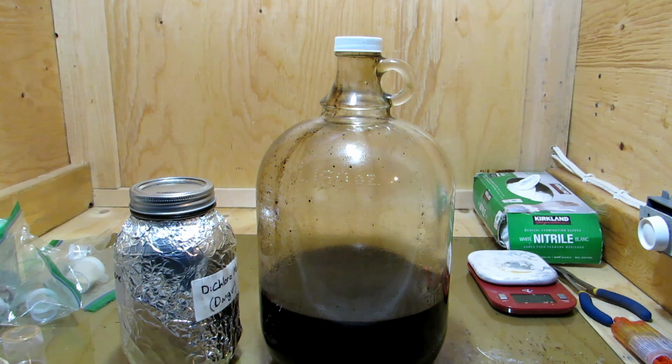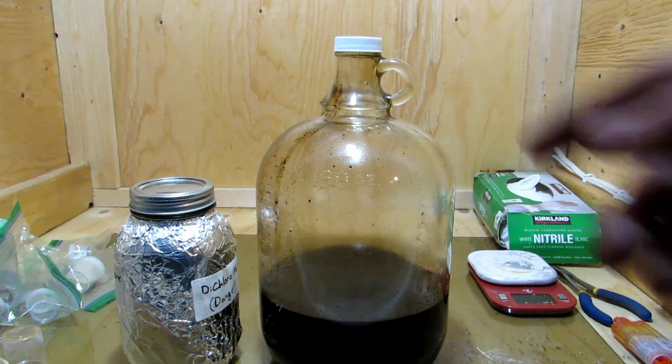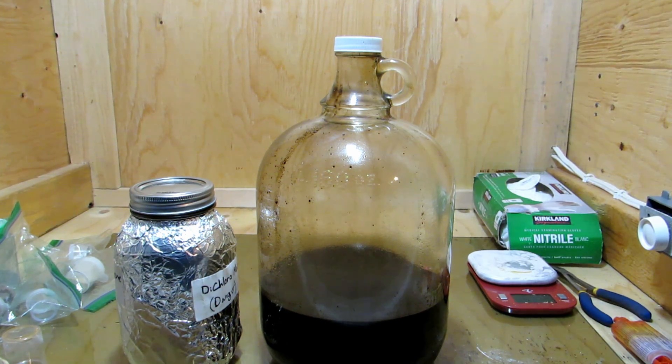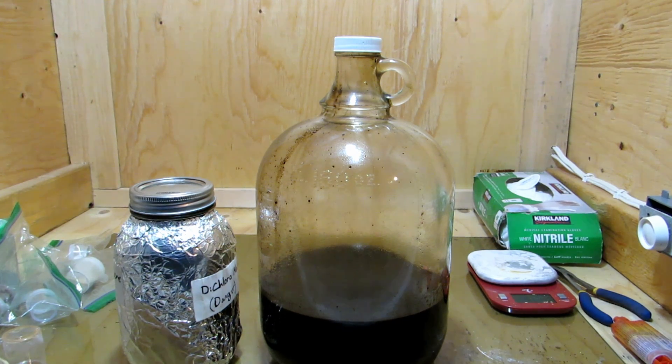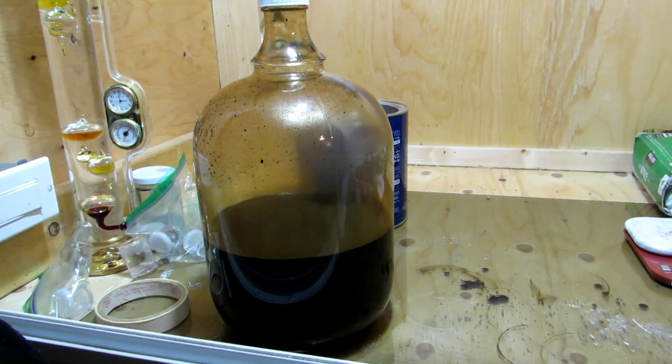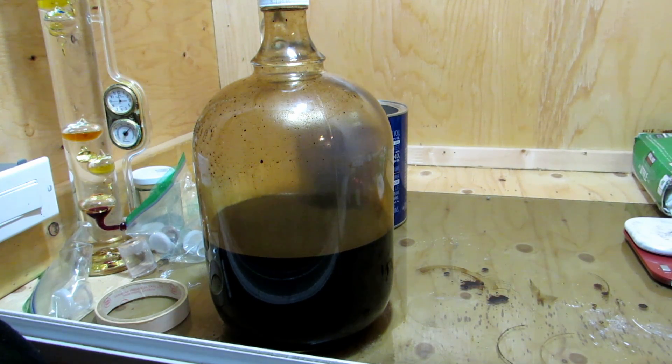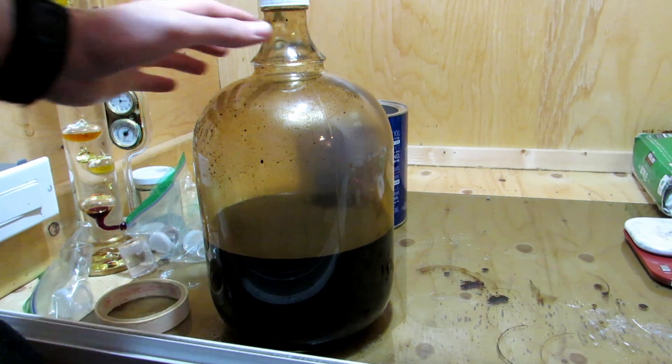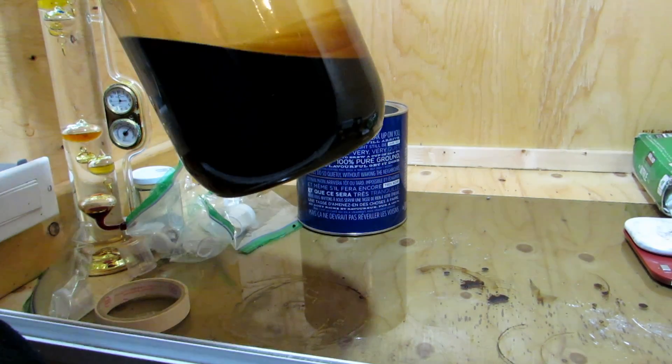We're going to add in all of our dichloromethane, and then we're going to be mixing this up fairly vigorously, but not too vigorously because we might form an emulsion. Hopefully all our caffeine will go into the dichloromethane layer. Our dichloromethane has been added, and I shook it around fairly vigorously. I shook it to get everything well mixed. Hopefully most of our caffeine is dissolved into the dichloromethane.